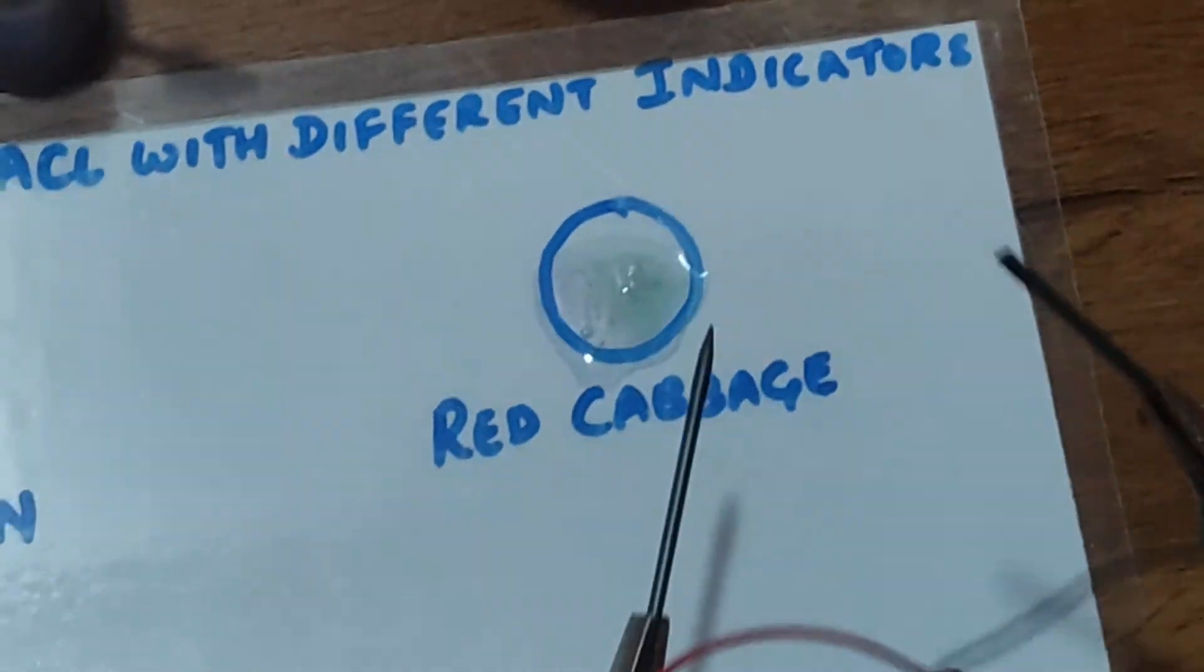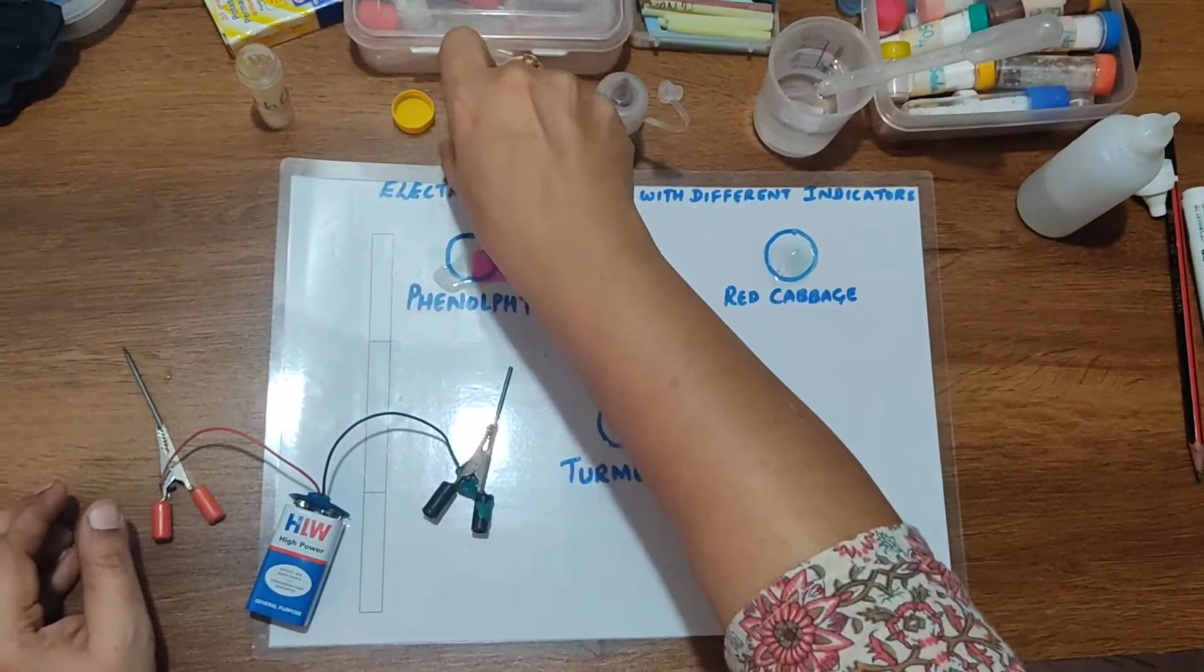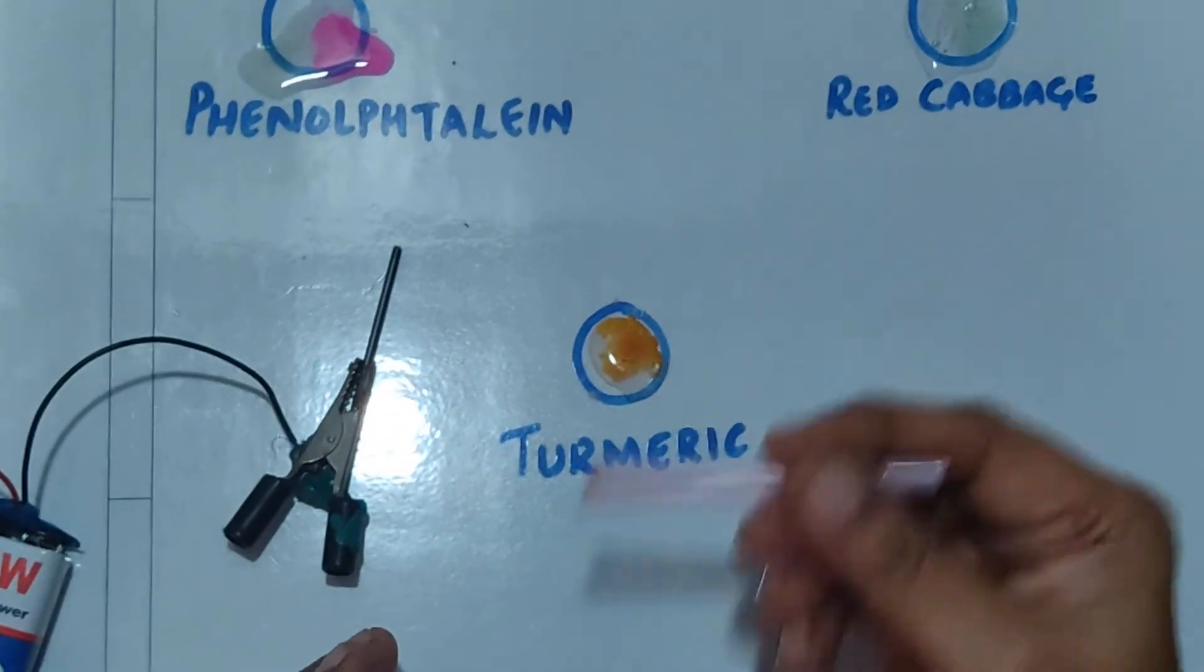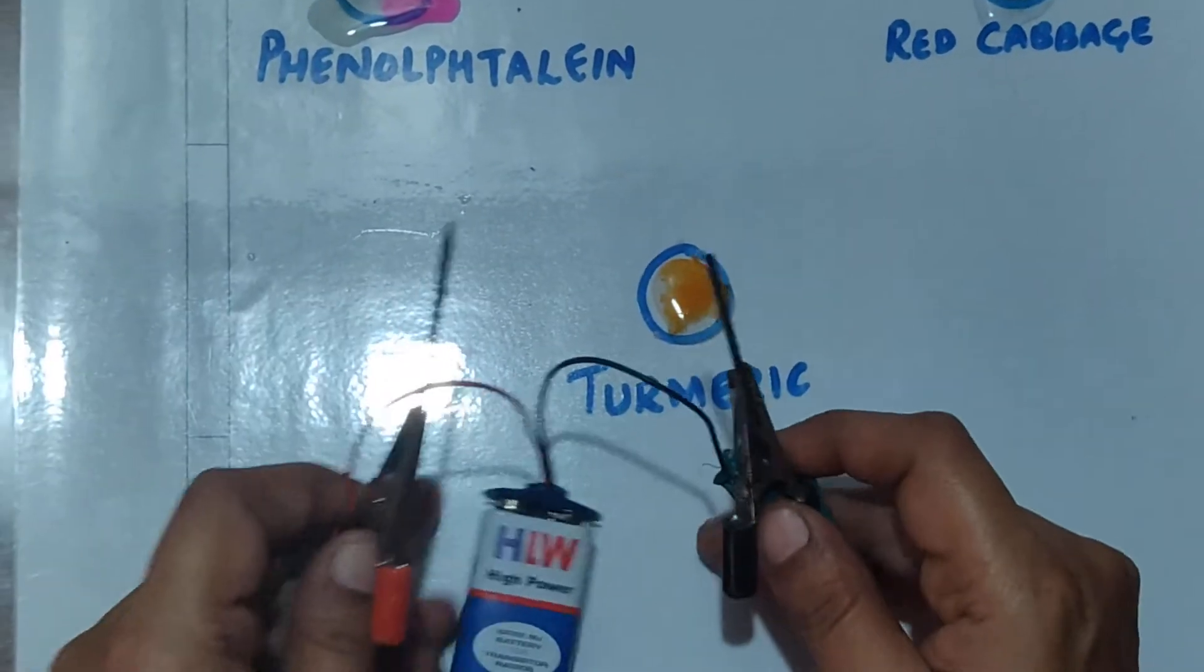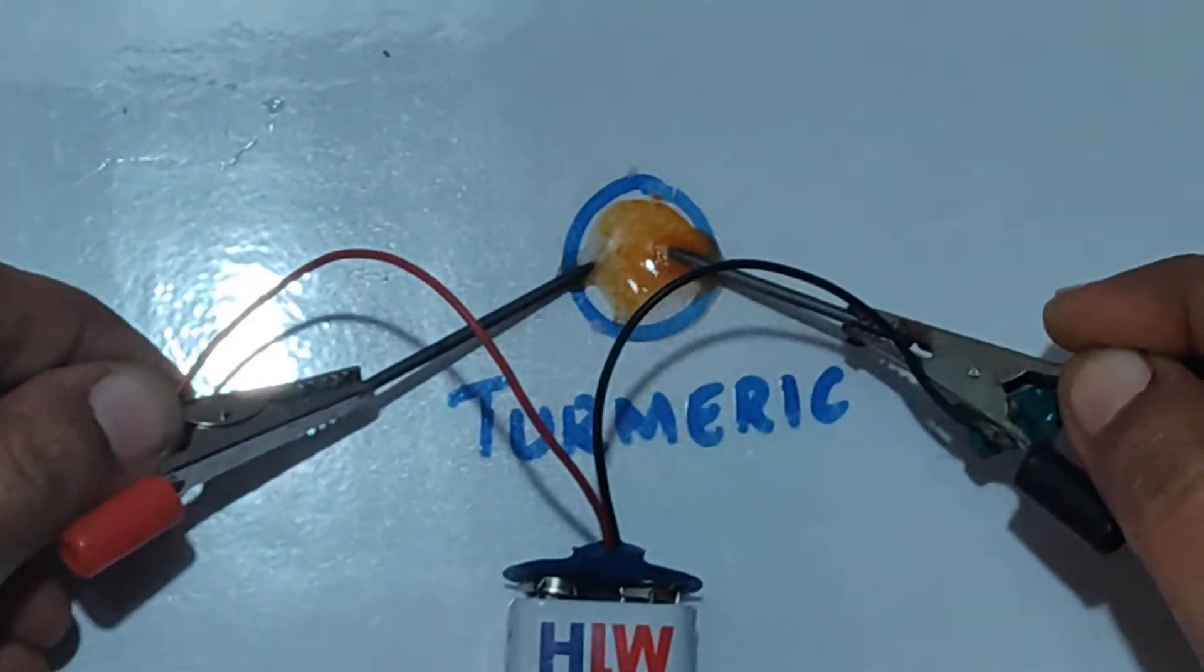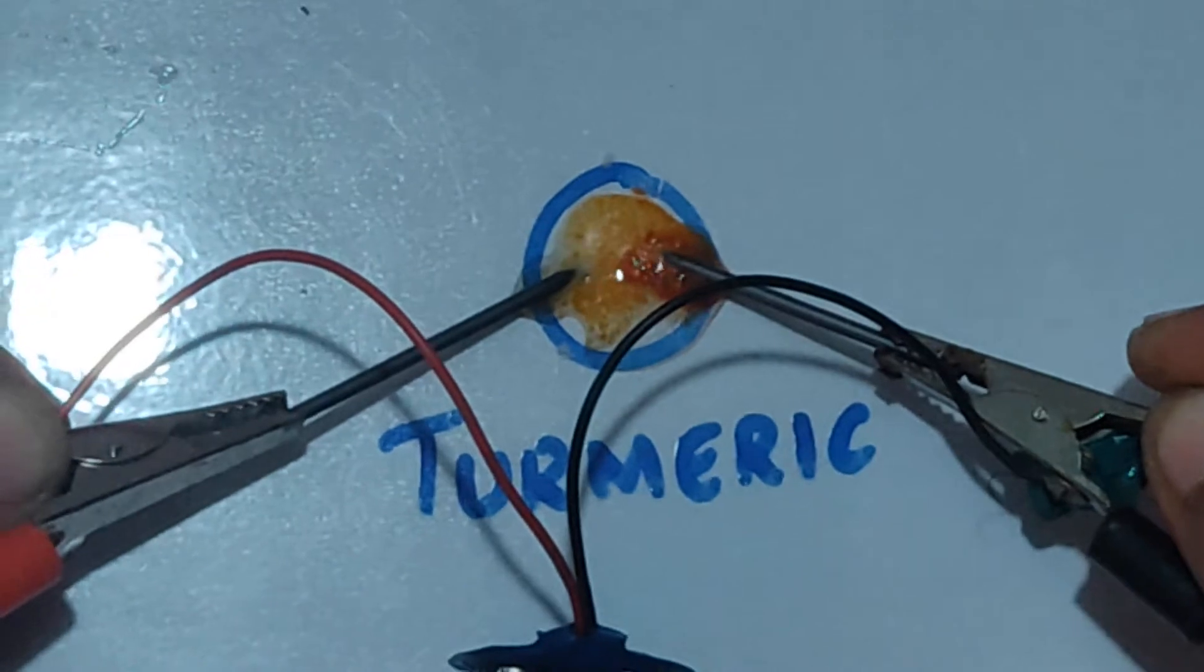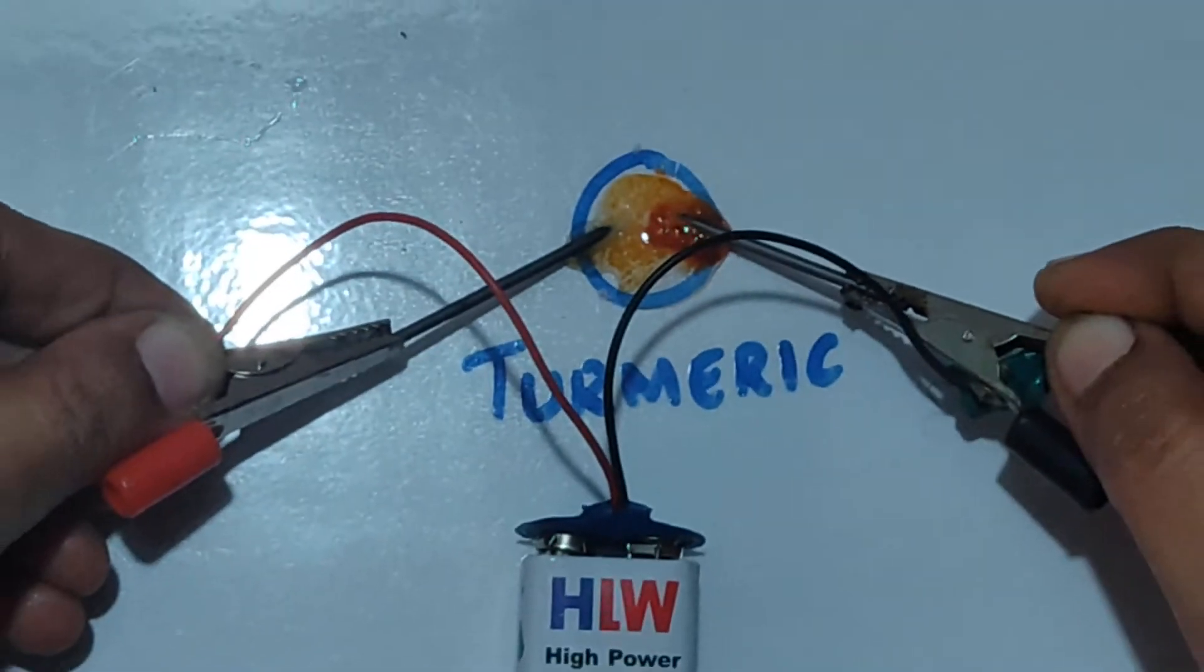Now let me try out with turmeric and see what happens. At the negative electrode you can clearly see the red color, and at the positive electrode you can see slightly bluish green color. The yellow color is changing to bluish green color.